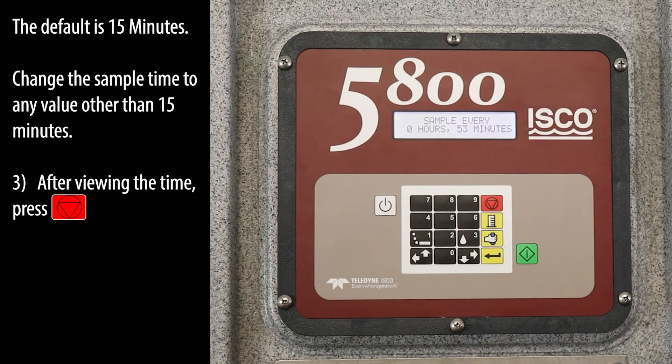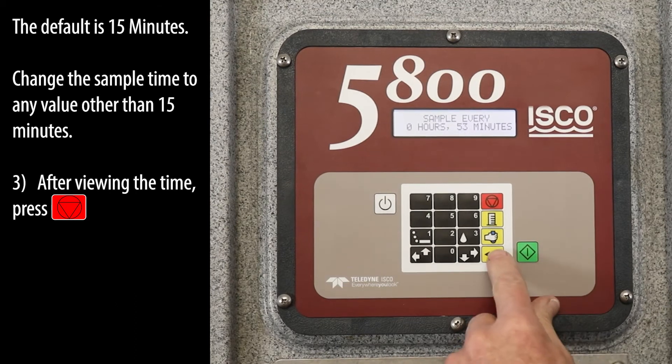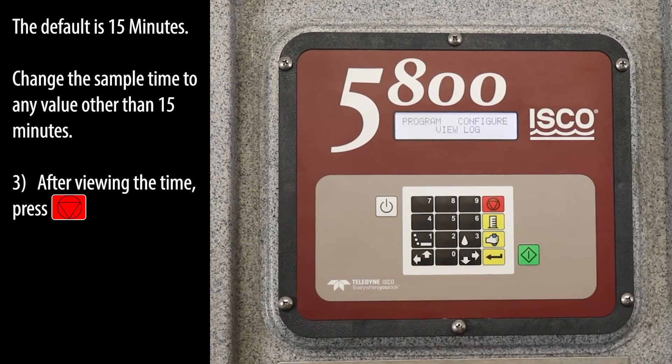The default is 15 minutes. Change the sample time to any value other than 15 minutes. After viewing the time, press the red stop key.